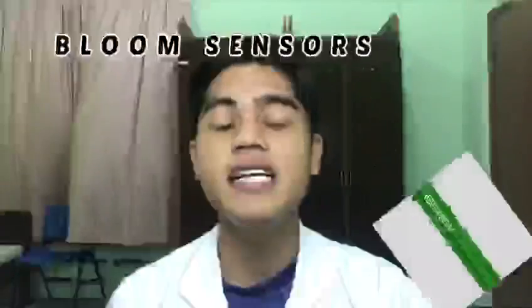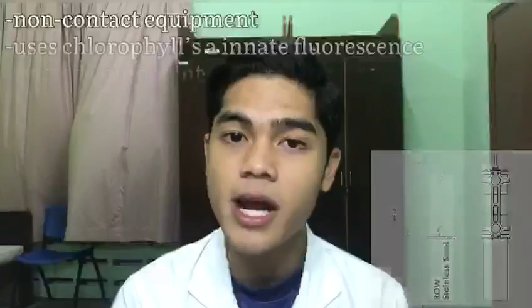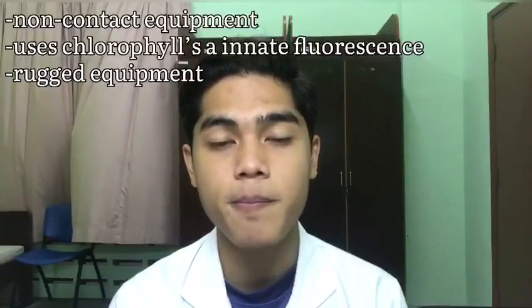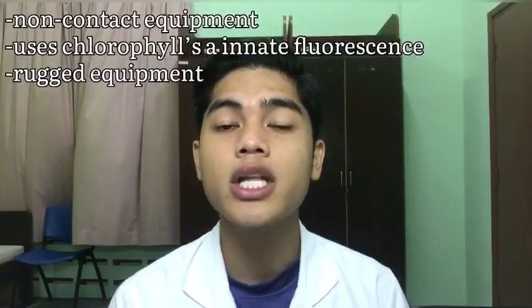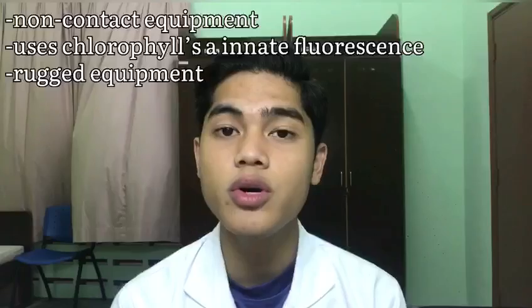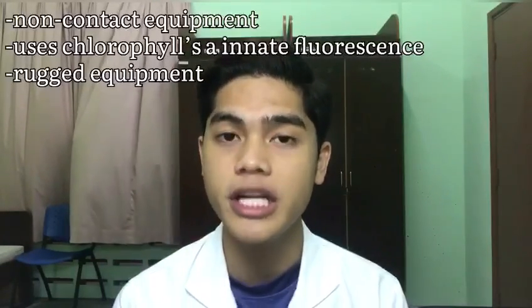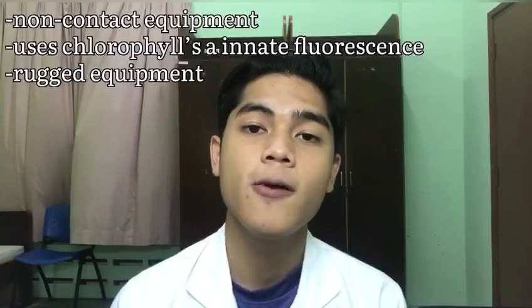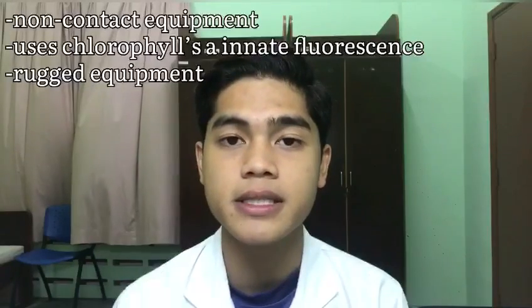So, the next equipment is the algal bloom sensor. The algal bloom sensor is a non-contact equipment which can monitor the concentration of chlorophyll A. This sensor uses chlorophyll's innate fluorescence to detect the growth of blue-green algae and sends an alert when the threshold is reached. This equipment is rugged and has been installed around the world's environment.